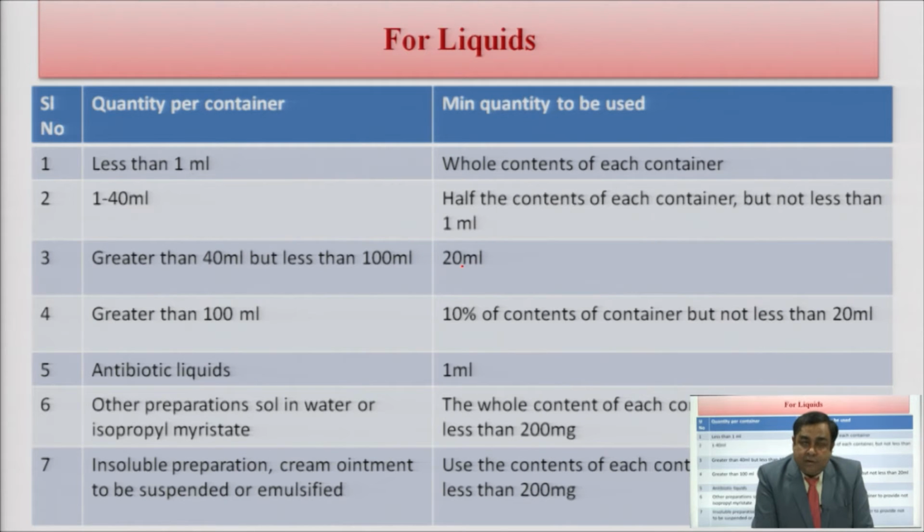If any compound which you are testing has an antimicrobial action, you need to block or mask the antimicrobial property by any method, it may be a chemical or an enzymatic method, so that the compound should not exhibit any antimicrobial action against the contaminant.